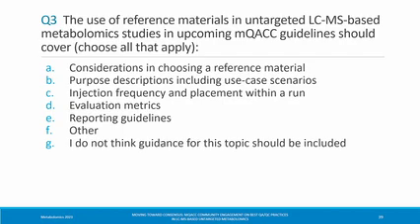Yeah, cost. And maybe just as a response to the other question about their utility or use scenarios, we use it for accuracy determination and cross-platform comparisons. Unfortunately for NIST, at least for the polar metabolites, there's not an extensive range of metabolites. They are often measured by different platforms themselves. But it does provide us some reassurance that we have some mutual agreement. So that's the primary use in our case.